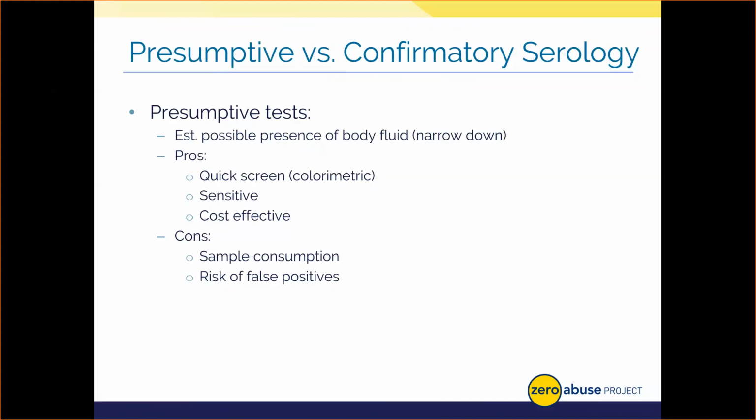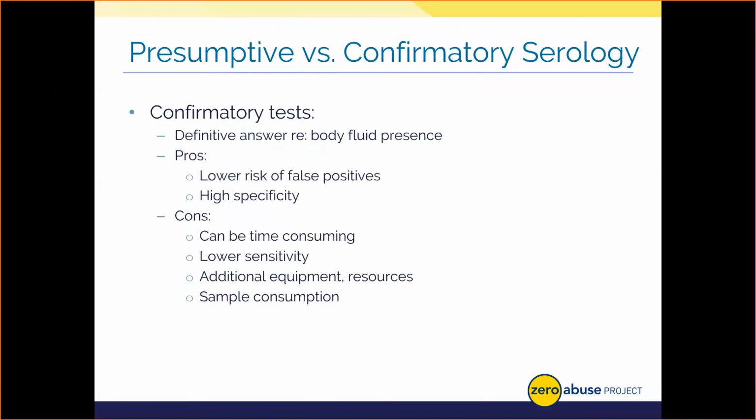Sometimes, then, as I mentioned earlier, it's best to just forgo serological testing and go straight to DNA. Again, I'd rather learn whose DNA is derived from a sample than know that it's blood or some other body fluid, but never get a DNA profile to correlate to an individual in our case. Moving on, let's talk about confirmatory tests.